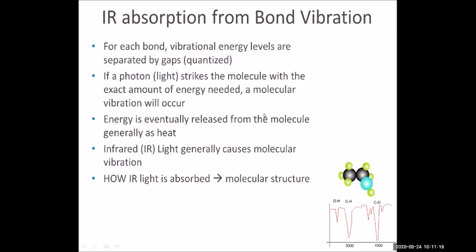So the basic principle for infrared spectroscopy is we measure, compared with the background, how much the sample absorbs at certain frequencies. We can measure the wavelength or frequency where the absorption takes place. And also we can measure how strong or weak the infrared absorption is. So both can tell us information. This shows you an example, ethanol. The ethanol molecule has CH bonds, a CC bond, a CO bond, and an OH bond. Each bond's vibration gives us a specific frequency and strength. You can see the OH bond absorbs at fairly high frequency. And the CH bond, because there are 5 CH bonds in the molecule, absorbs fairly strongly. And finally, there's a very strong carbon-oxygen absorption. So all these can tell us information about the molecular structure.